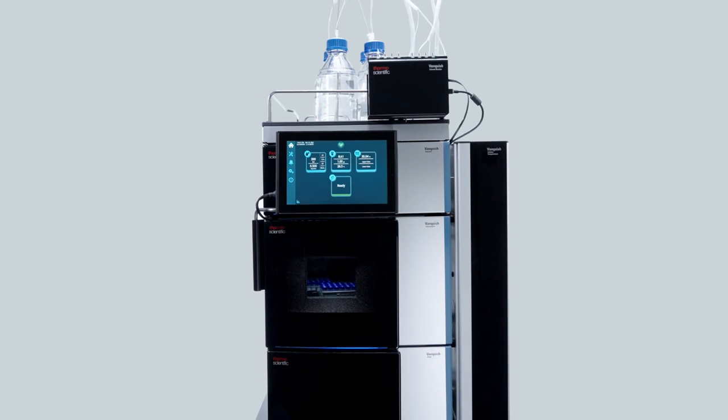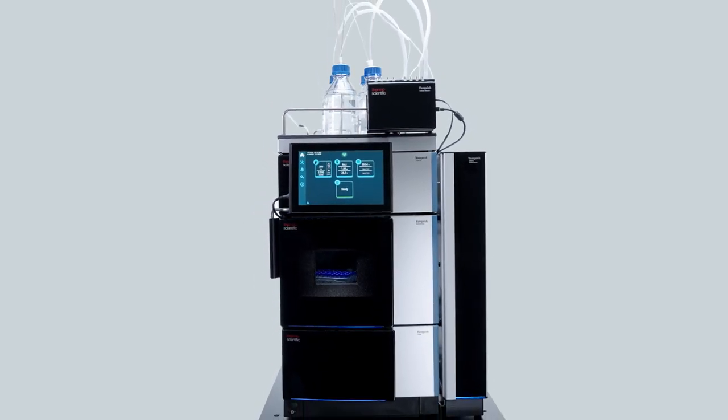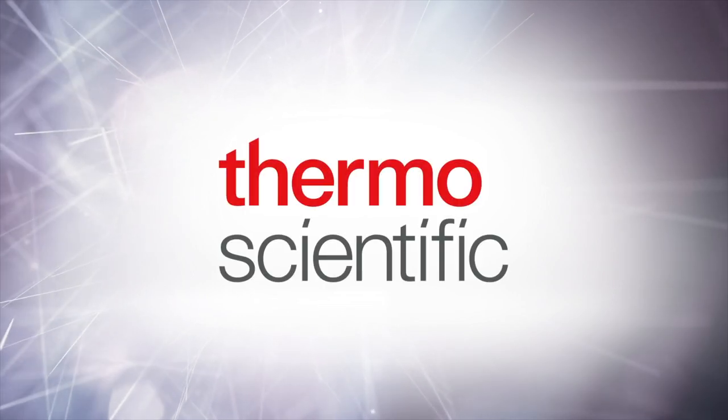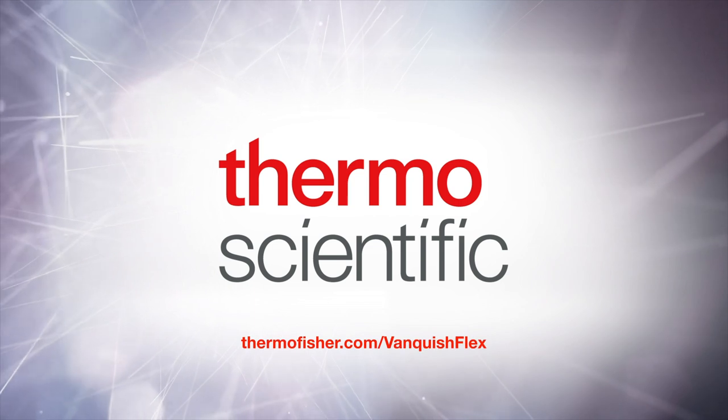Choose a UHPLC system that not only meets the needs of today but also addresses the challenges of tomorrow. VanquishFlex UHPLC Systems. Complete flexibility. For more information, visit thermofisher.com/vanquishflex.